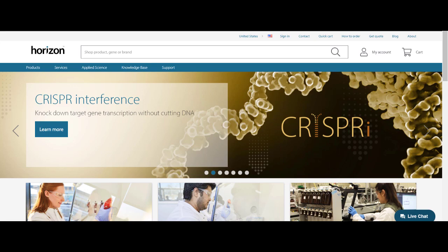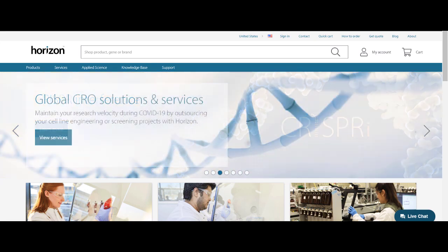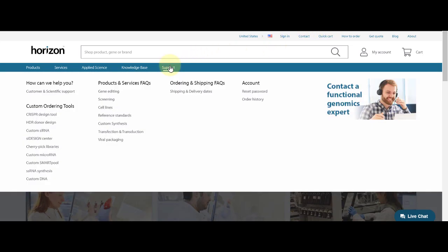In this video, we'll show you how to design a plasmid DNA donor template for your homology-directed repair experiment. If you have not already identified a guide RNA and tested it for efficient cutting of your target gene, you should go to the CRISPR design tool before continuing.